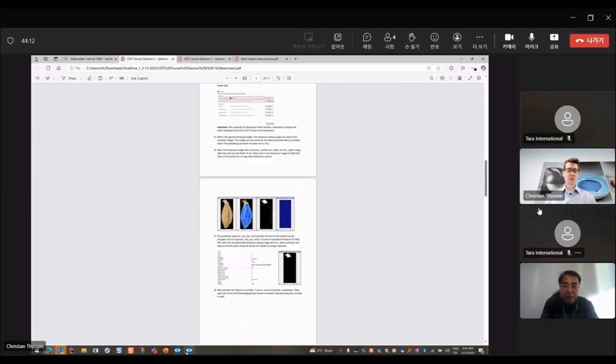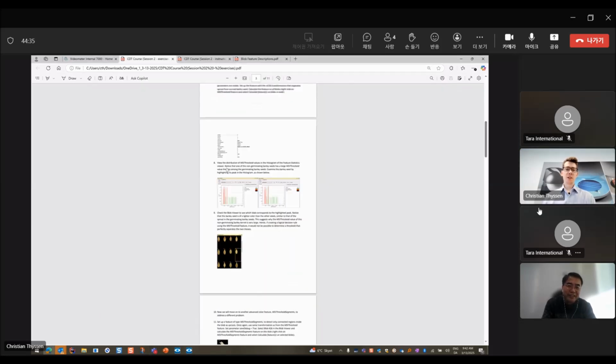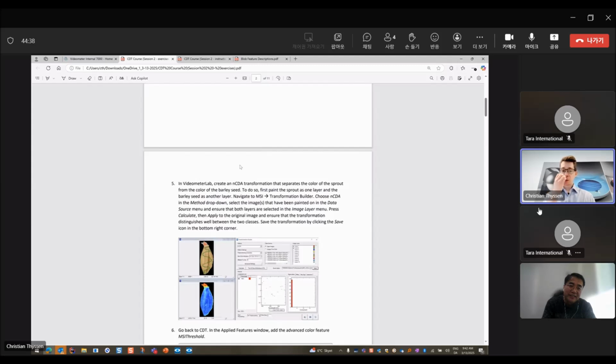Actually, before attending this section 2, I pre-studied the exercise, but between the standards, I don't understand which one. Maybe I'm not familiar with the function of the software. So I just recommend it. Please understand. If there's anything in the exercise that doesn't make sense, we would very much like to know it. We try to make it as understandable as possible, but maybe there's something confusing or that doesn't make sense. So we would very much like to know if anything can be improved.